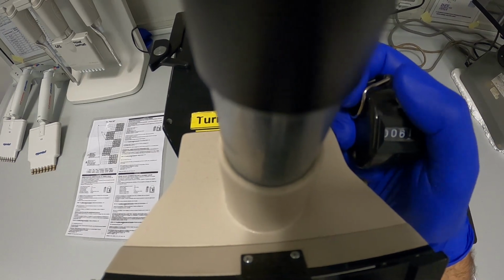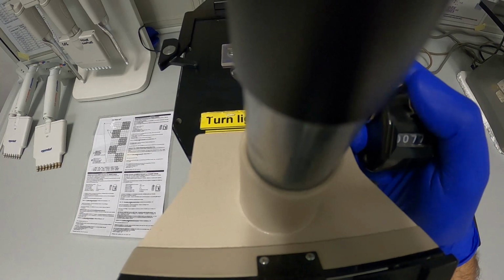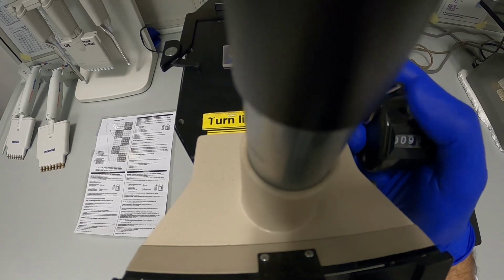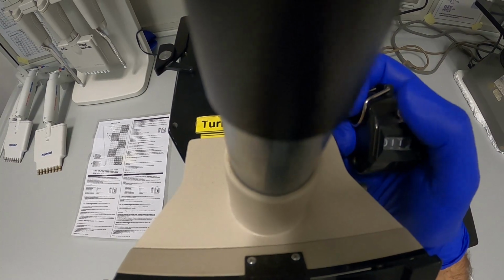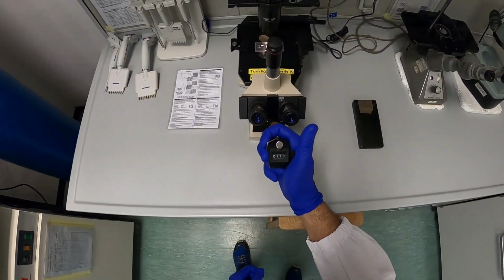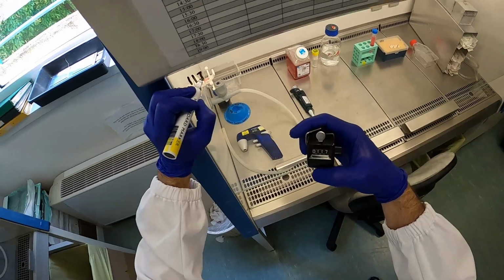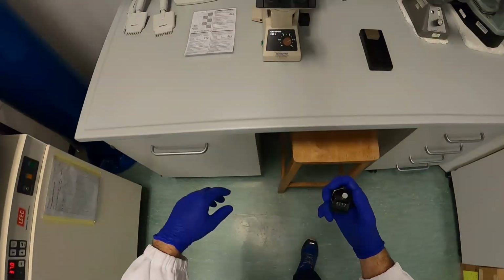Sometimes with this you really wish you had fewer cells per ml because it's just quicker. However, of course, the important thing is that you have enough cells in suspension to do your experiment, so you need to get it right. How many did you count? 117, okay. So let's write that down on the glass screen. And then let's count the other sides as well.